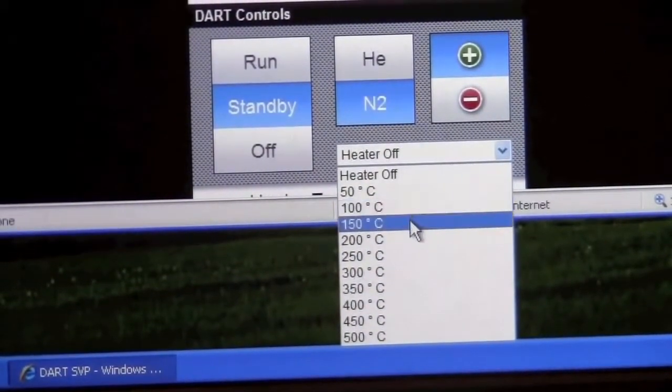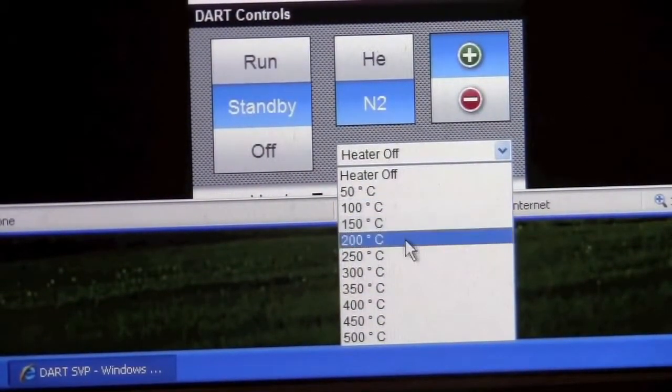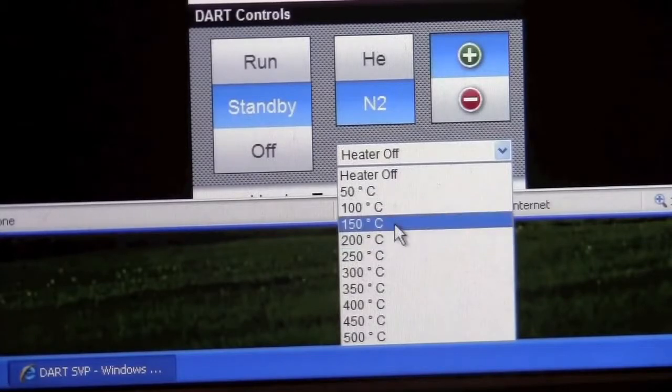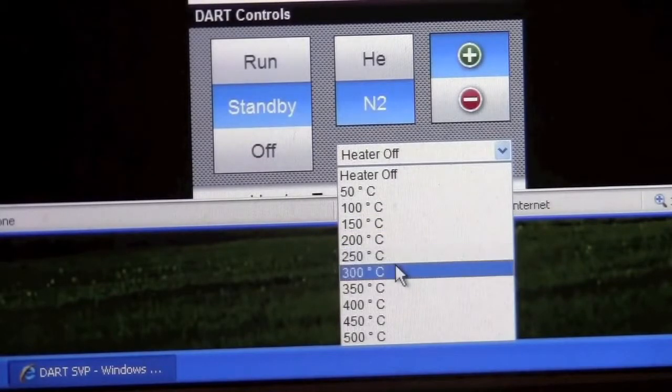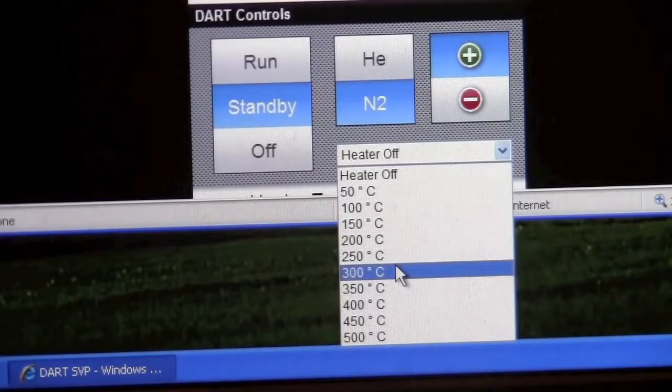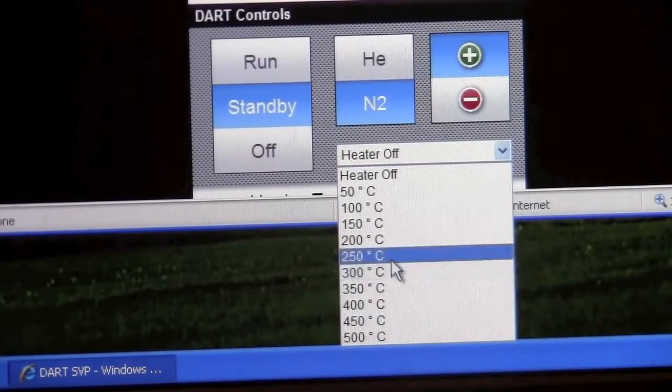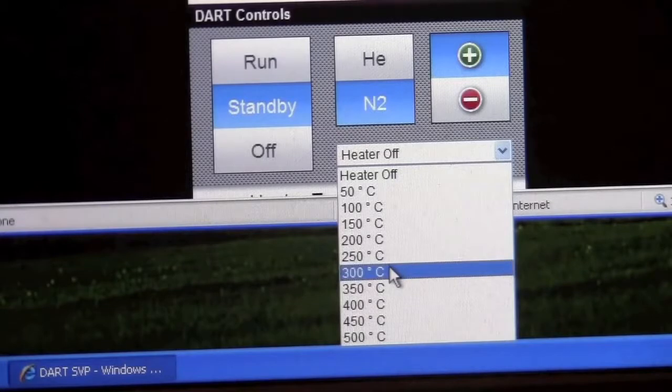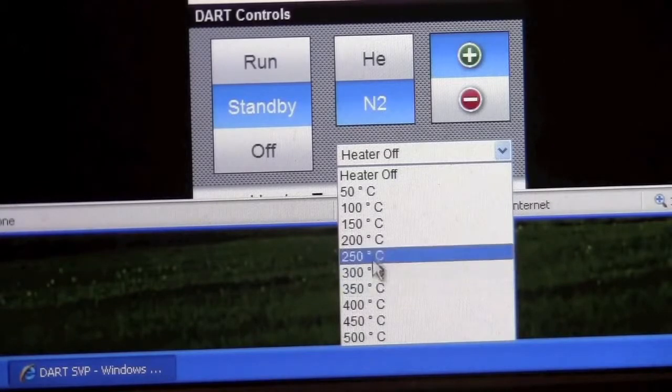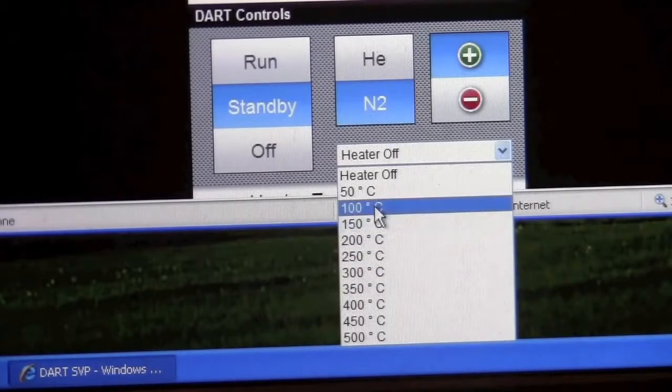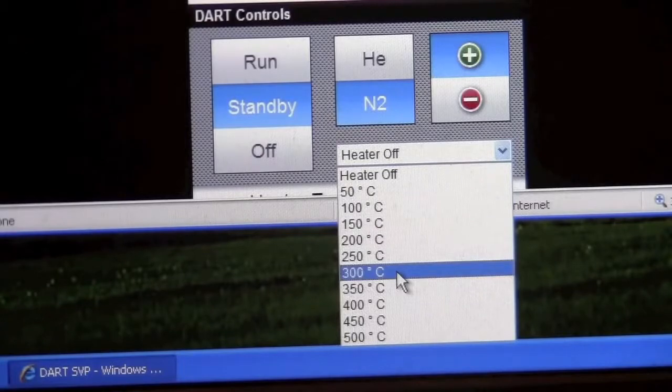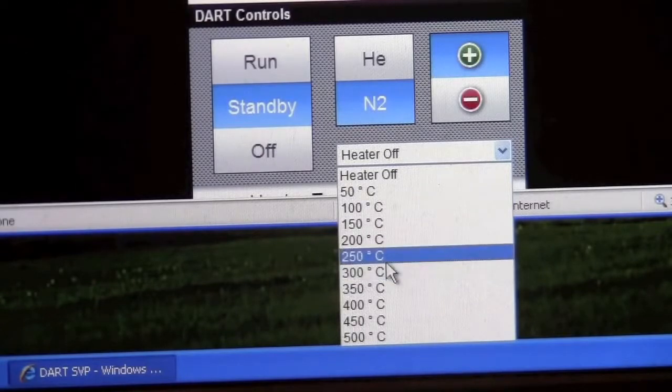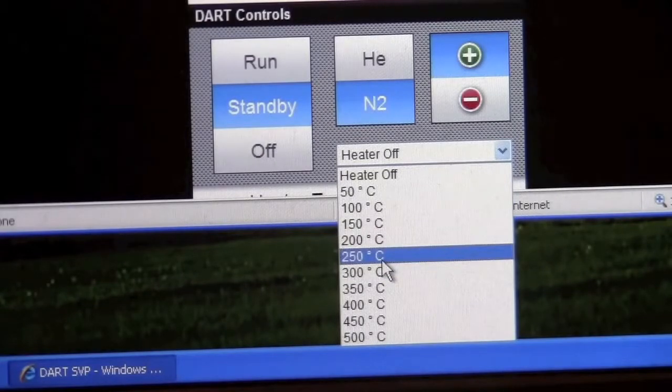Colder is better for more fragile molecules. Higher may give you more signal, but at some point it will start to damage your molecule. Typically somewhere between 100 and 300 degrees Celsius seems to be normal. I'm going to set it to 250.